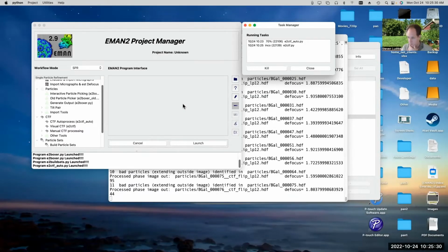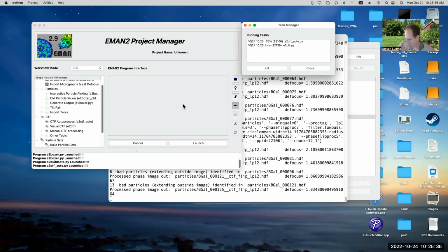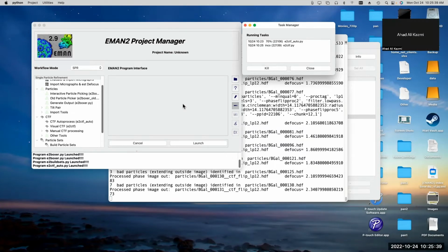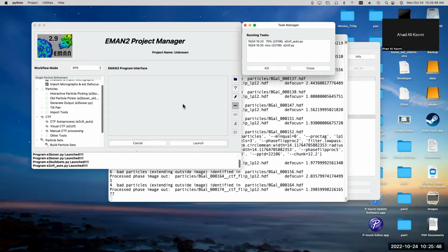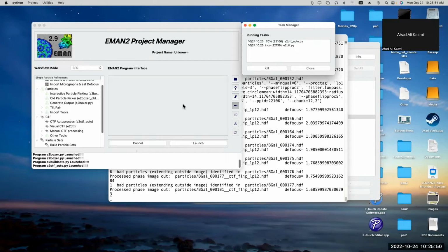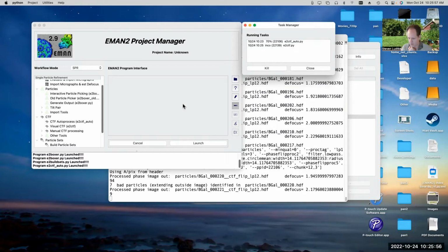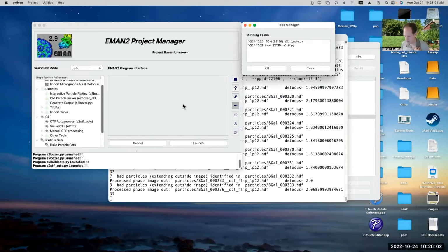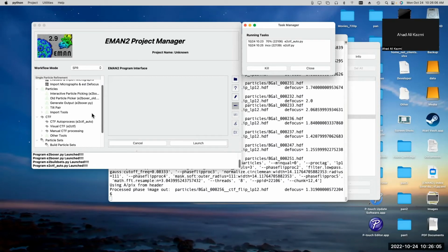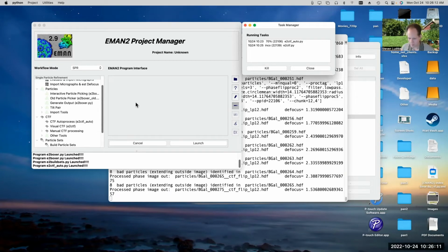Anyone have any questions about any of this while we're waiting? Or have any problems when they did any of this? So when doing the correction now, is it estimating the defocus landscape per particle? So does it divide it into patches, or are you still limited to the whole micrograph? This is just determining the defocus on a whole micrograph basis, but it's using the particles to determine the defocus rather than regions of the entire micrograph. Okay, understood. So it's determining basically the mean defocus of all the particles in one frame. Okay, great.